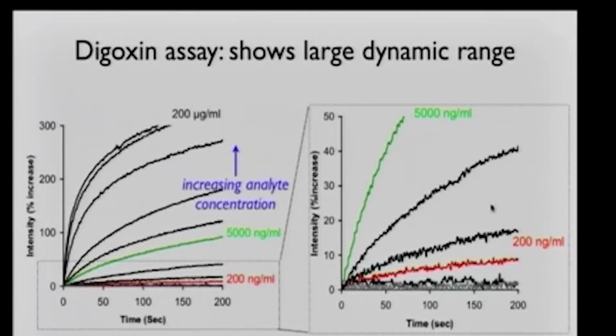Yes. So we can go from 200 micrograms per mil to 200 nanograms per mil label free in 20 microliters of solution in this experiment. I think that's quite good, but I think probably we can tweak it around to enhance the signal. So this is still, of course, label-free. It also is in that little breadboard setup I showed you earlier. So not optimized in any way. In fact, some of these experiments we had done earlier just on a webcam with a manual capture of the intensity.